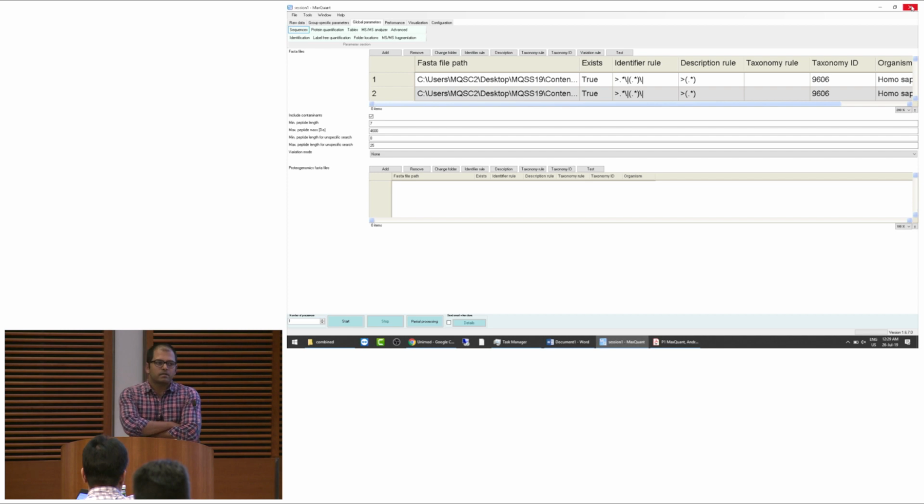Could you please repeat the question? So I have a few samples, let's say 5, and I know from an RNA experiment, for instance, that they are very different in terms of gene expression, and I expect the protein to be different. But I still want to do label-free quantification. Should I change one of those default parameters or just leave it as it is?